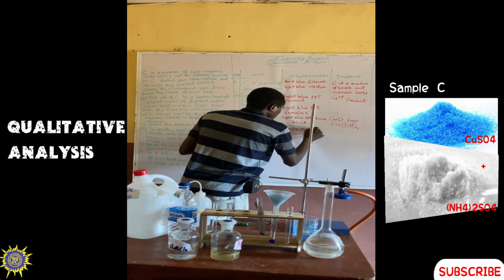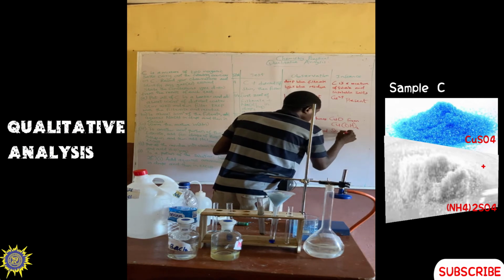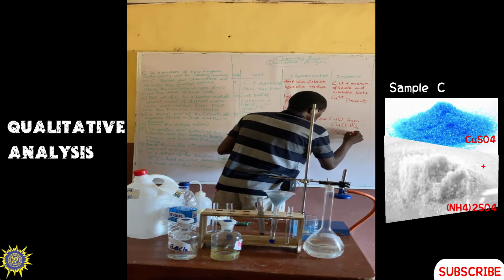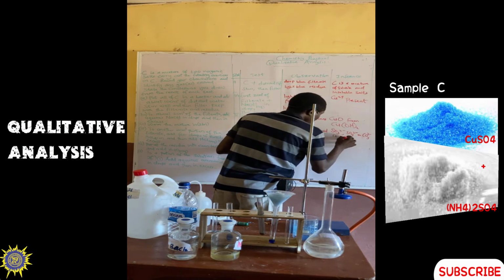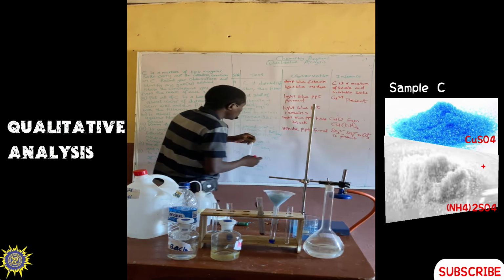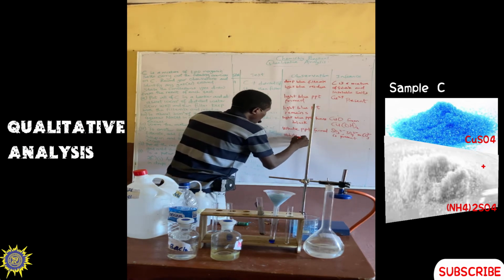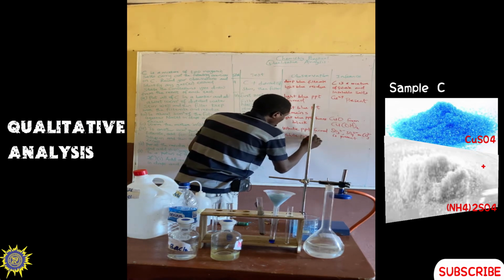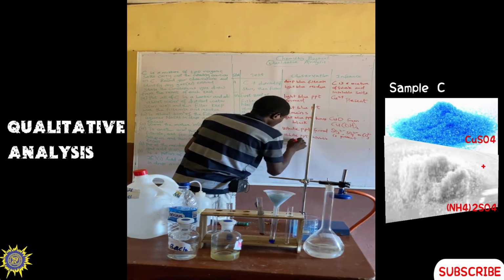So a white precipitate formed indicates that there is the presence of SO3 2 minus, SO4 2 minus, or CO3 2 minus. The white precipitate now persists in excess. Now let's see whether the white precipitate is insoluble in excess.